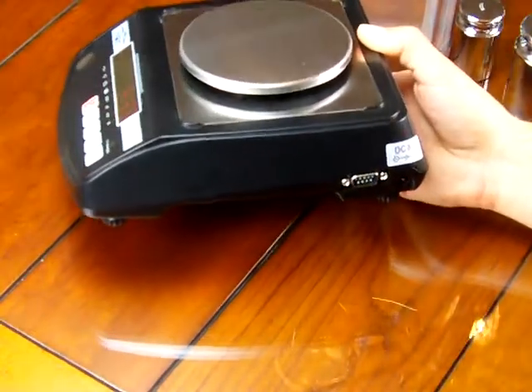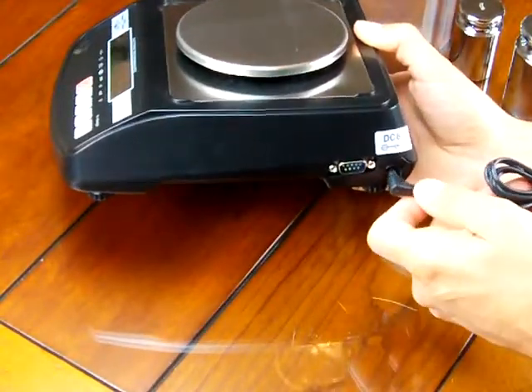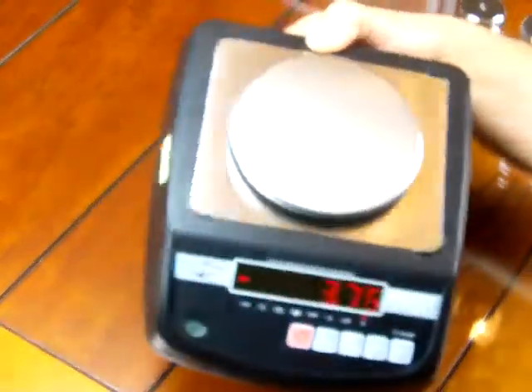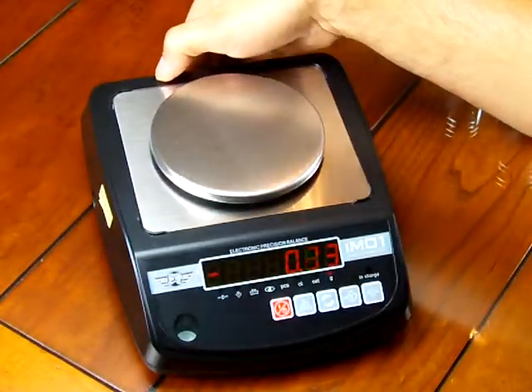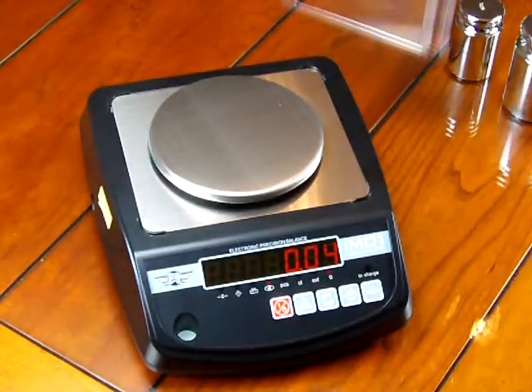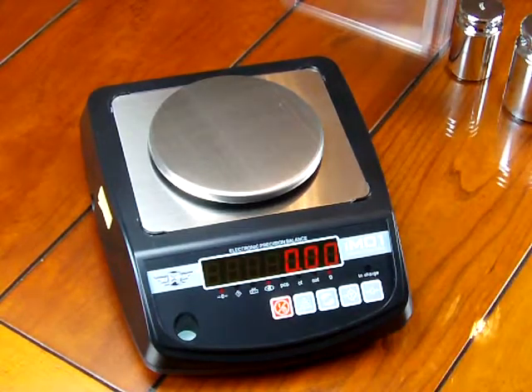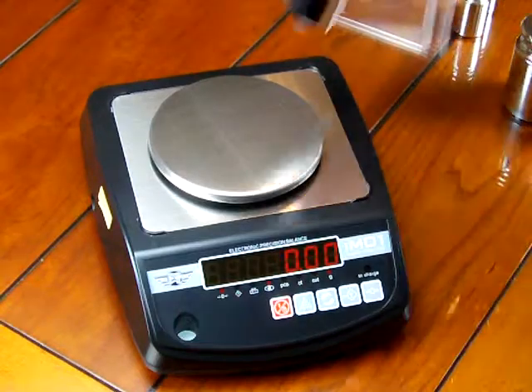If you want to run it off the AC adapter, great. If you want to run it off batteries, the scale is totally portable — you can be out in the field and not worry about needing an AC receptacle. So again, simple scale, great affordable price, especially for schools. MyWay is a great little scale company making scales affordable for when you have tight budget restraints and are limited in the amount of money you can spend. MyWay is that niche market to fill.